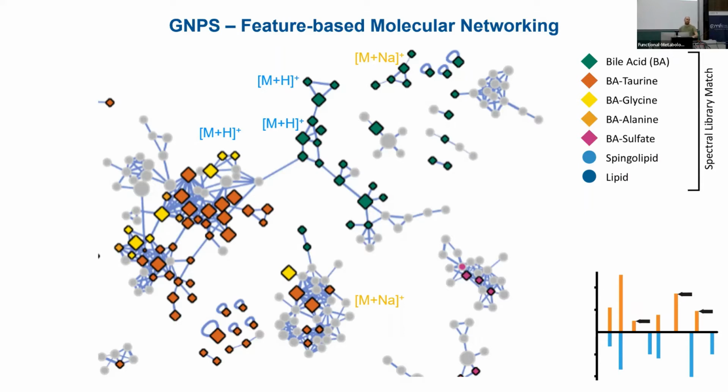Maybe on that note, it's also important to stress that that's also one metric and one way to look at it. There are more and more new metrics emerging, like spec2vec from Justin and others would be one. Or now MS2DeepScore, or spectral entropy, right, by the Fiehn Lab. I guess none of them is absolute, right? But they can be complementary. So again, it's important to keep in mind that's one way of looking at the data.